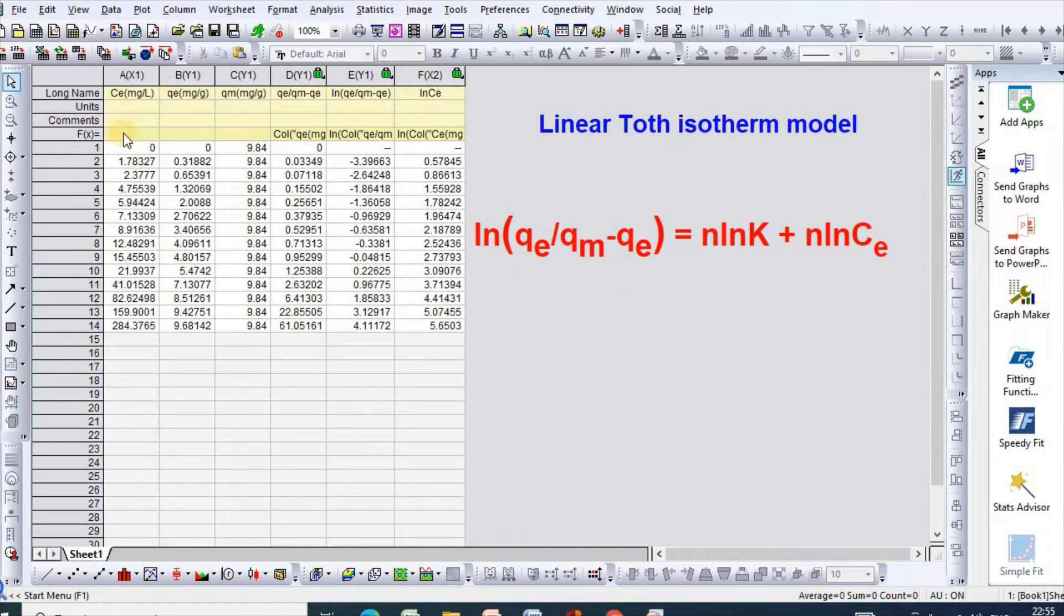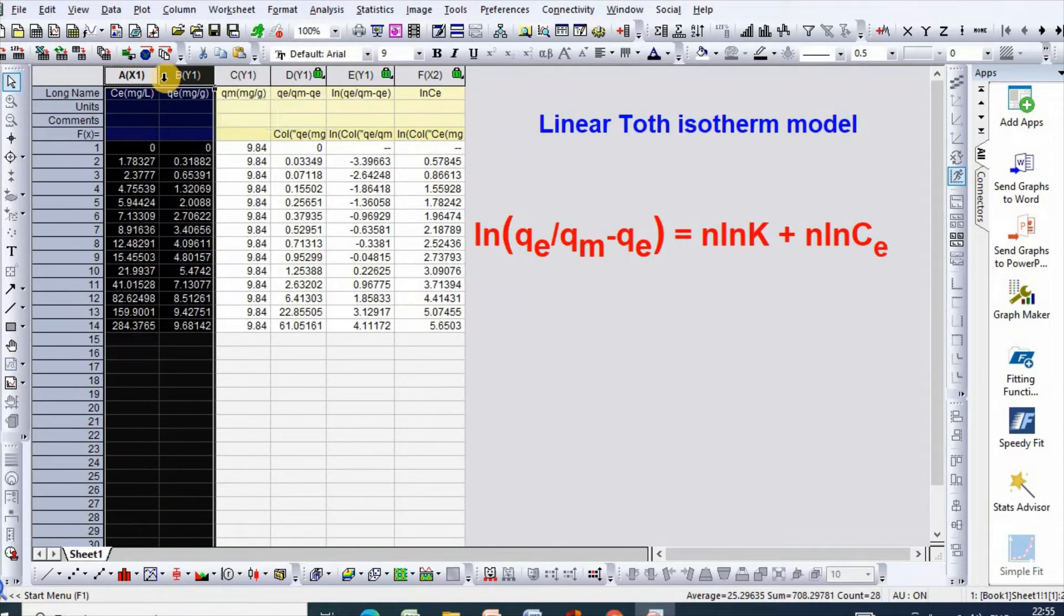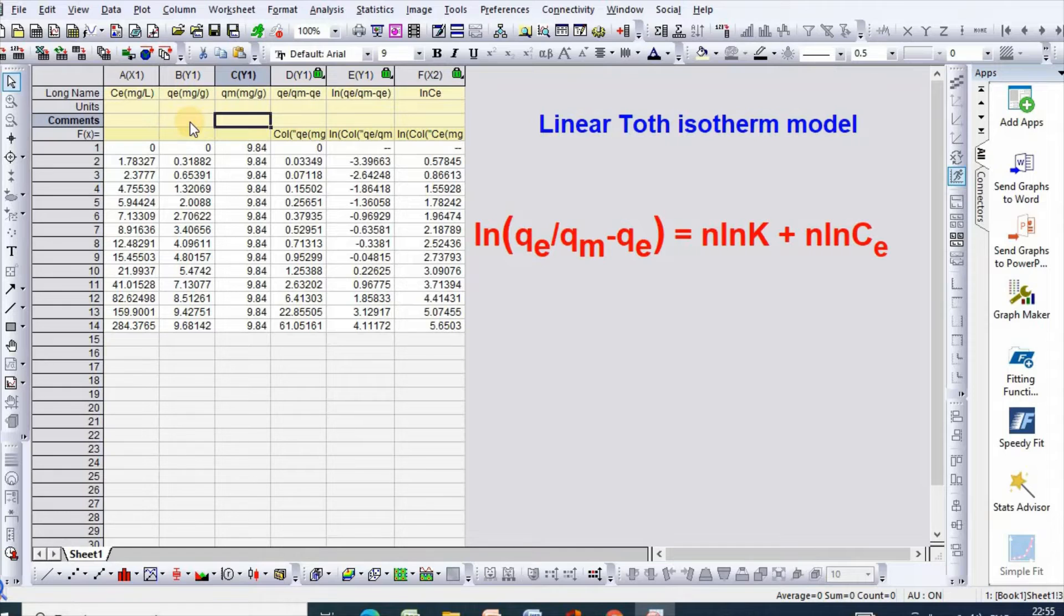In order to fit, I have taken adsorption data for equilibrium concentration and amount adsorbed. Then, initially, you need to find out QM.